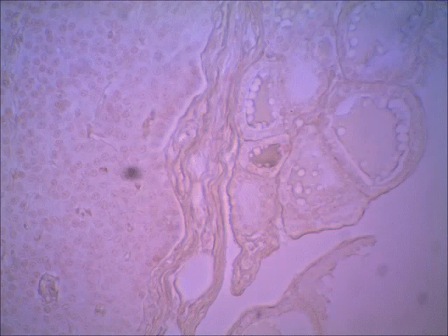So on a lab test or a quiz, I might have a picture like this one where you're seeing some thyroid follicles, but I may ask you, what's this on the left here? Or I may put it at the top or the bottom. You don't memorize left and right, of course, but you get the idea. If you see a glandular-looking organ, glandular meaning it's got the clusters of cells, and you see follicles attached to it, then that organ that follicles are attached to would be the parathyroid. If I asked you the organ that the follicles are a part of, that would be the thyroid.